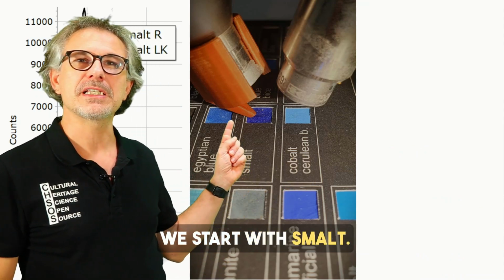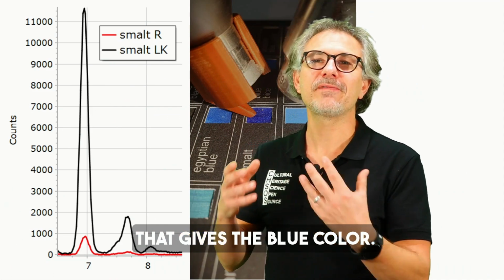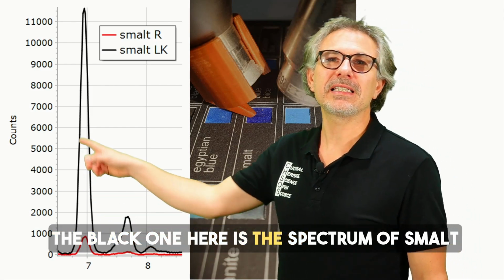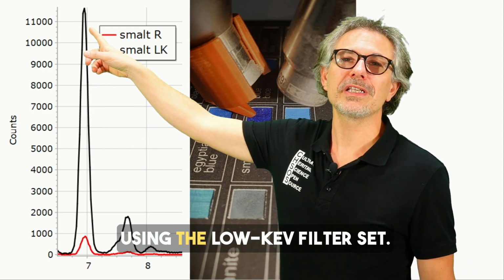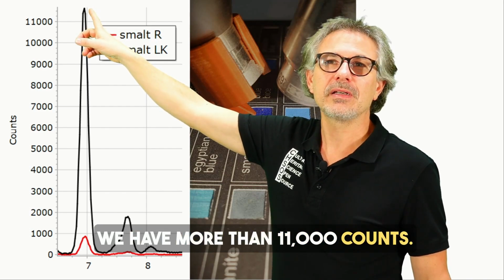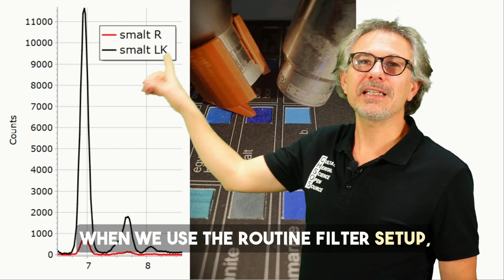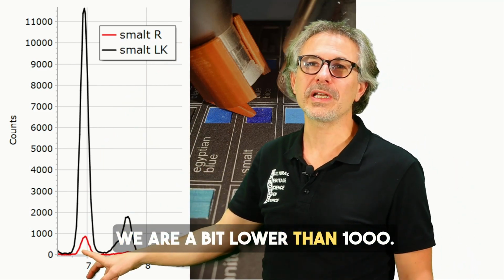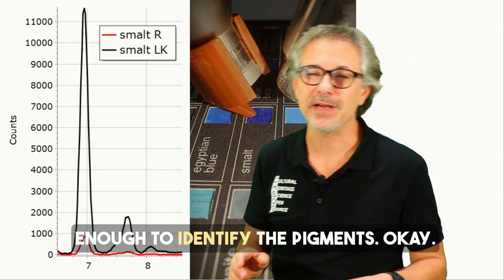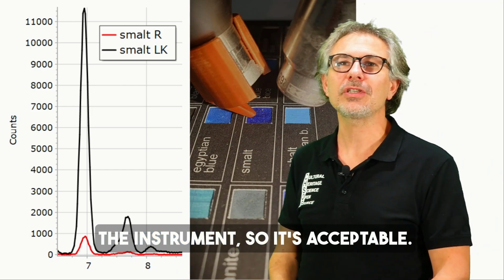We start with smalt. Smalt is a glass containing cobalt that gives the blue color. The black one here is the spectrum of smalt using the low keV filter set. We have more than 11,000 counts, so a very strong signal. When we use the routine filter setup, we are a bit lower than 1,000. Now, this 1,000 counts is still enough to identify the pigments, okay? It's well over the noise of the instrument, so it is acceptable.